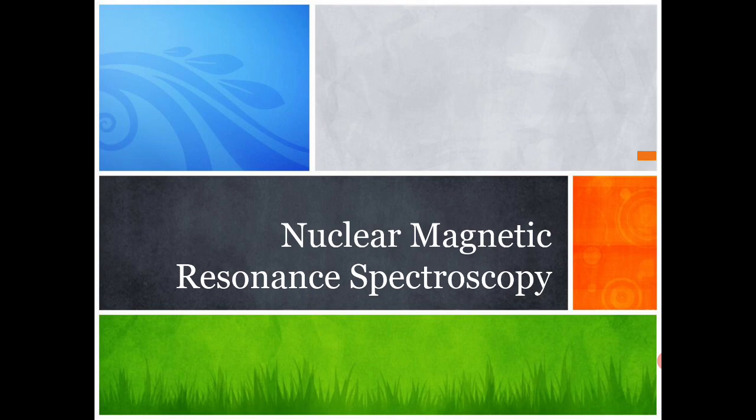We are discussing nuclear magnetic resonance spectroscopy. In the previous class, we were discussing chemical exchange or proton exchange. Actually, proton exchange and chemical exchange, even though it is a tool to understand certain exchange reactions, induces some complexity in the NMR spectrum.